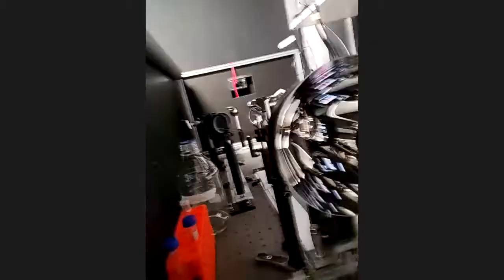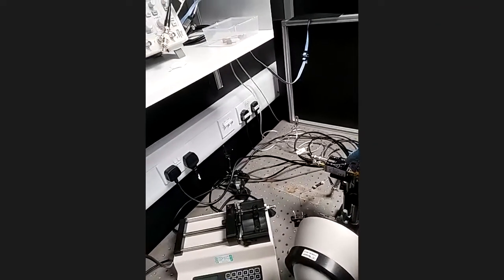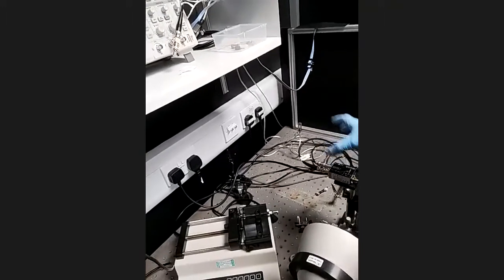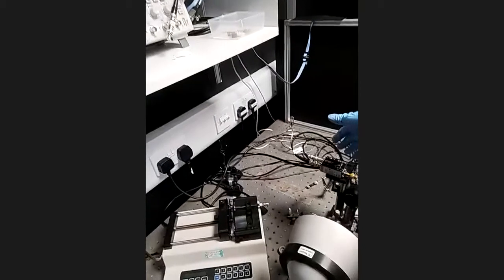And I don't know if you're able to see the inside of this thing. So this is a reflector that's shaped like an ellipse, which focuses the fluorescent light down onto this ultrafast detector here. And so we measure the fluorescence lifetime of the protein species with this, and then that's sent to a very fast oscilloscope, and then that's recorded on the computer.